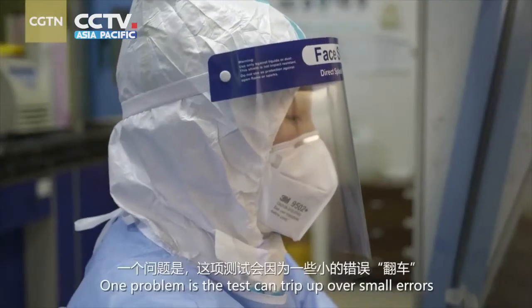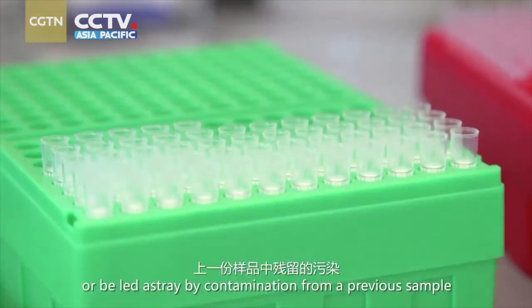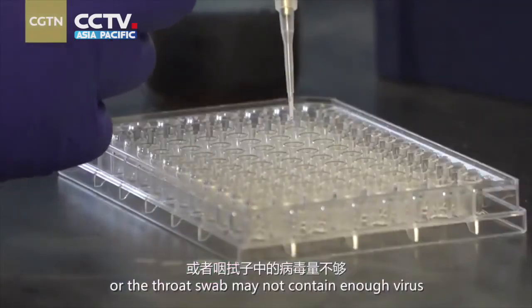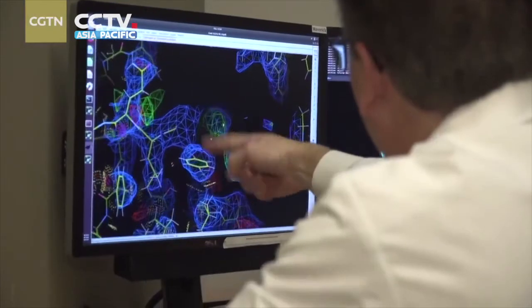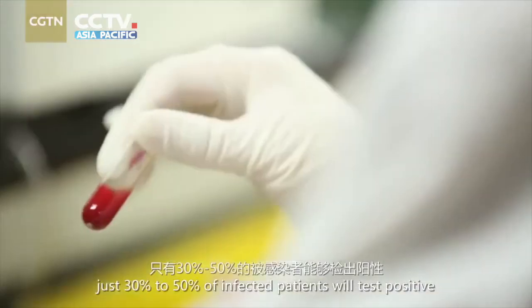One problem is the test can trip up over small errors. Primers can grab onto a piece of DNA in the wrong way, or be led astray by contamination from the previous sample, or the first swab may not contain enough virus. All this could lead to a wrong result. Chinese scientists say in practice, just 30% to 50% of infected patients will test positive.